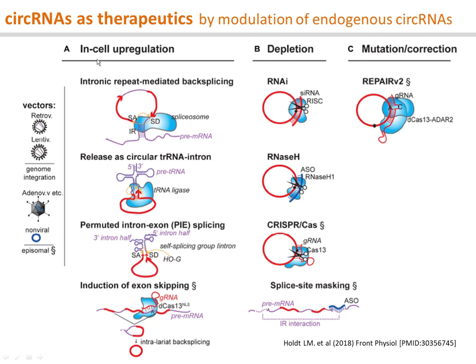To overexpress circular RNAs, recombinant RNAs can be circularized by flanking inverted repeats such as ALU. The circular RNAs can be expressed from a tRNA intron expression vector. The circular RNA is spliced and circularized using the bulge helix bulge (BHB) splicing motif, or using group 1 intron, which has self-splicing ribozyme activity. It's used to excise and circularize permutation-arranged intron-exon RNA.